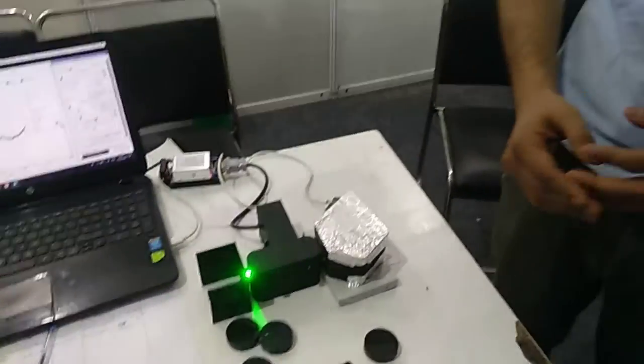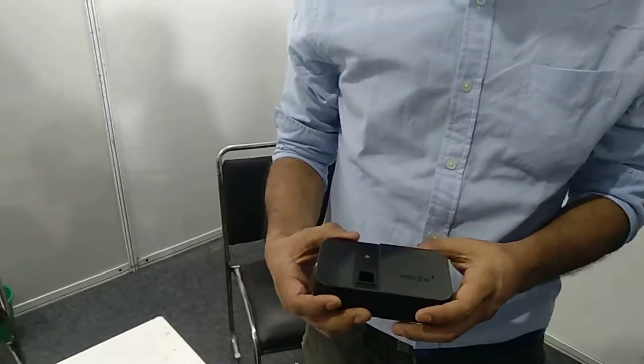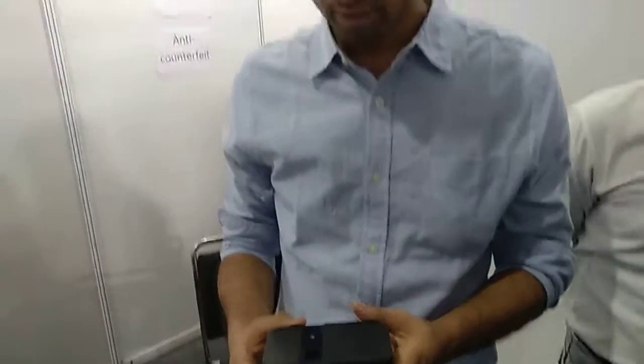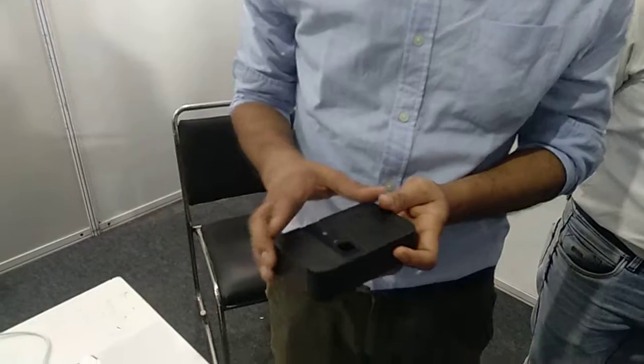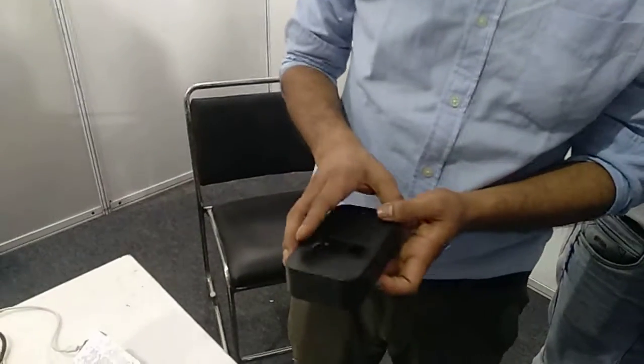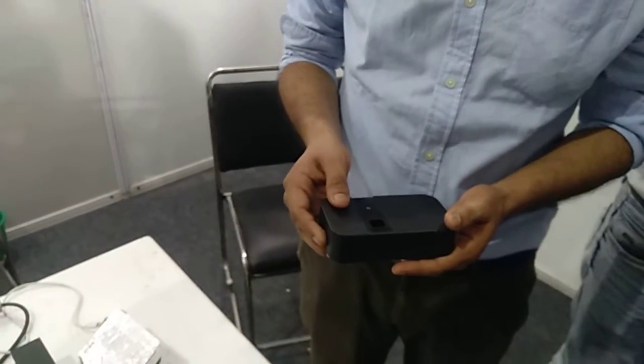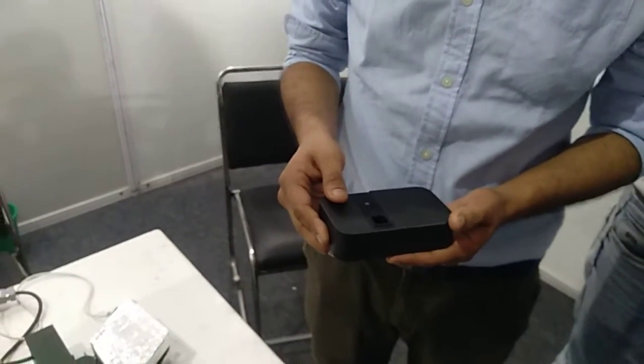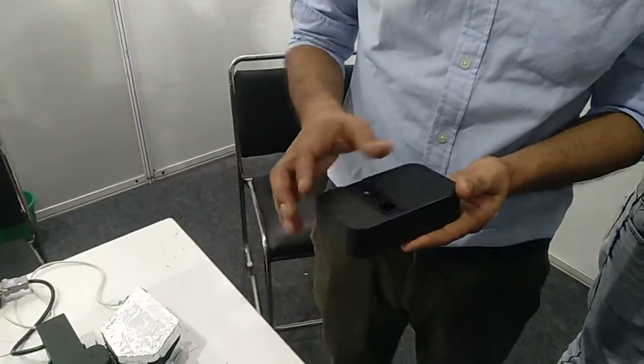Our first product is Prism Plus. It is a handheld spectrophotometer that works in 200 to 1100 nanometers. It is used in application diagnostics, pharmaceutical companies, and fake drug detection.